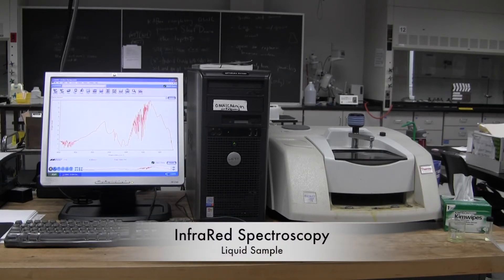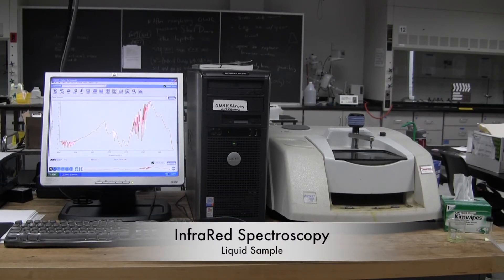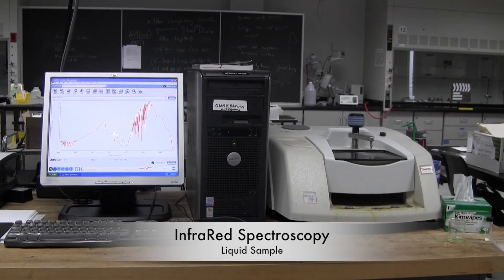In this lab, we will learn the procedure to obtain infrared or IR spectroscopy.